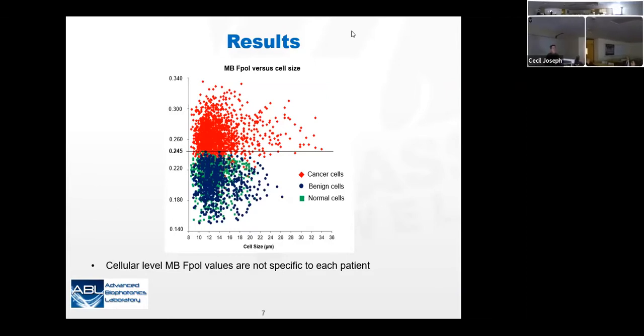So the incubation of the methylene blue: currently the staining time is 20 minutes. The plating time we're hoping to reduce with a new protocol. Instead of plating the cells, we're developing a smearing technique, using methods similar to those currently used for rapid on-site evaluation of cytology samples.